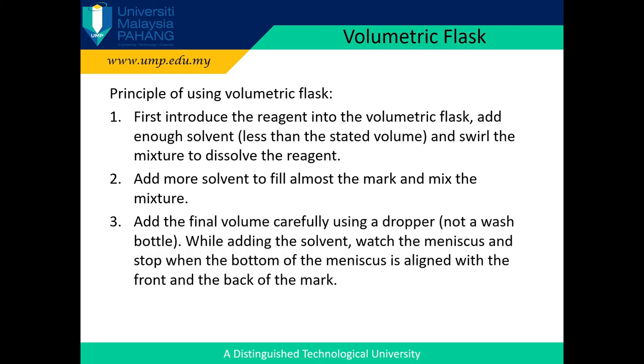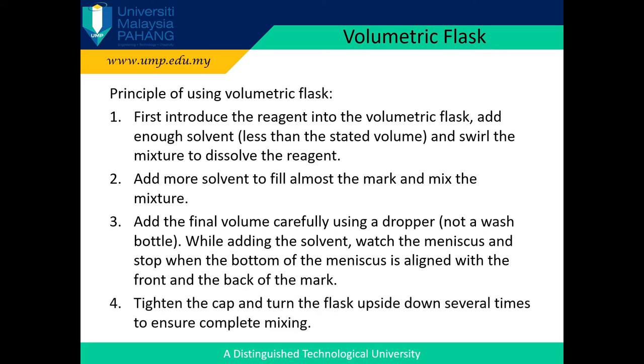Add the final volume carefully using a dropper, not a wash bottle. While adding the solvent, watch the meniscus and stop when the bottom of the meniscus is aligned with the front and the back of the mark. Tighten the cap and turn the flask upside down several times to ensure complete mixing.